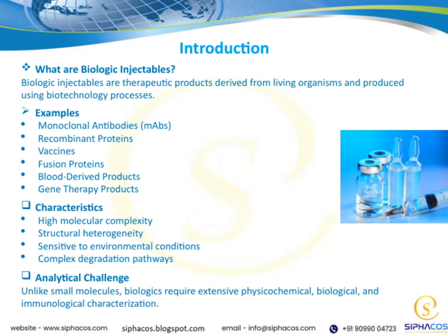What makes them unique is their complexity. They have large, intricate structures that can vary and are sensitive to their environment. Because of this, analyzing biologics is much more challenging than small molecules, requiring detailed physical, biological, and immune system testing.